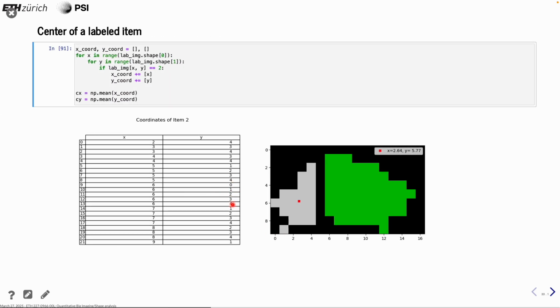actually I took that one. Okay, I took label 2. Anyway, from this one, we can compute with the help of this algorithm the center of this volume, and it comes right here. And that is something we usually compute for the objects to know where we have them, and with that we can also already start separating objects depending on where they are. Maybe we can see that some of these objects are clustering in different locations, and then we can tell something about that.